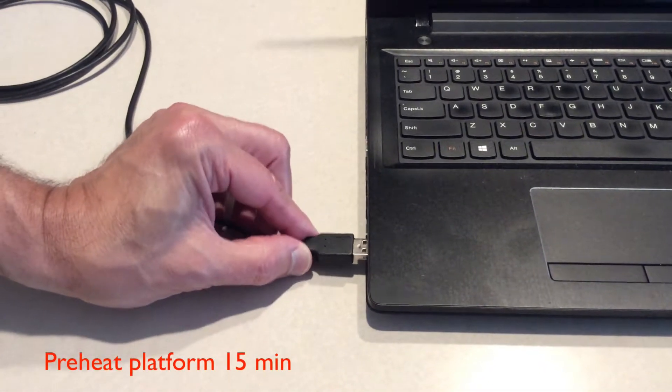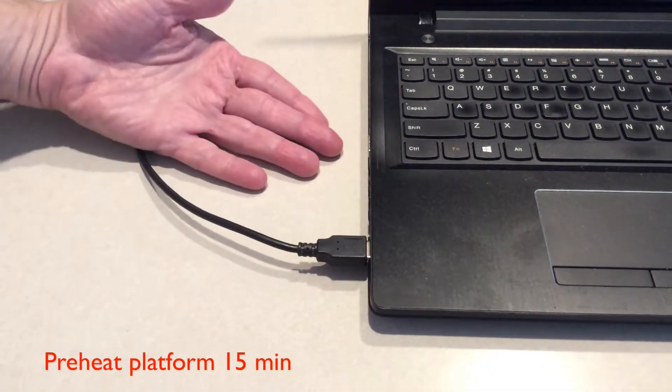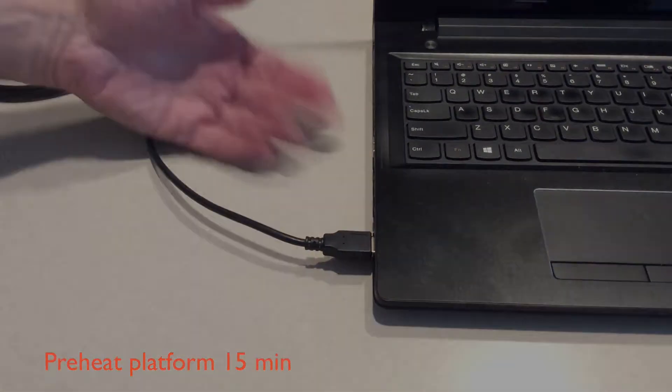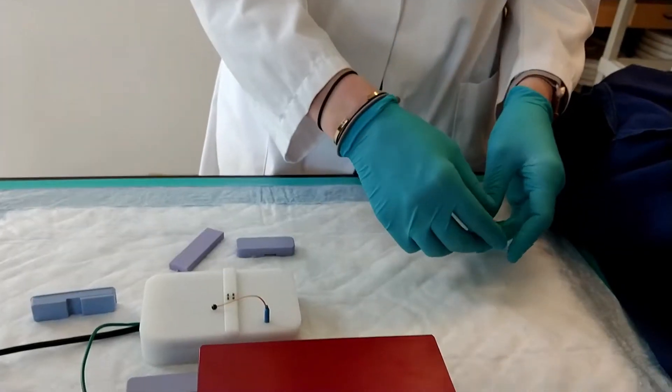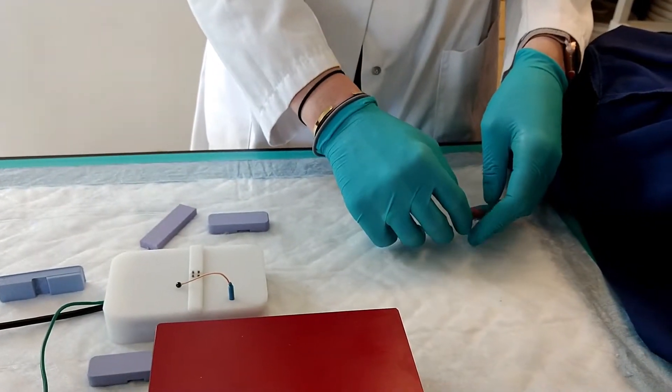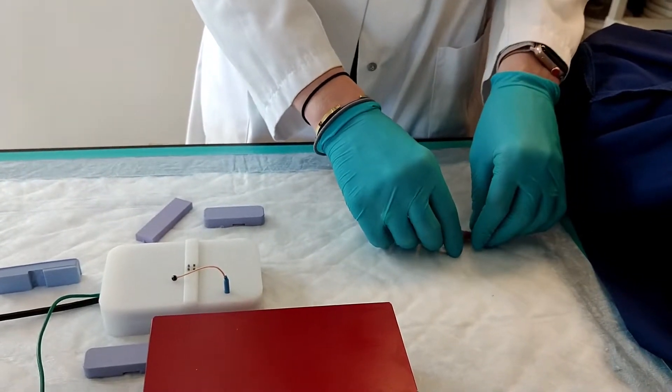The heating element is powered by USB, so plug it in 15 minutes earlier to ensure it's warmed up. With the platform all warmed up and the mouse ready to go, it's time to prepare the electrodes.